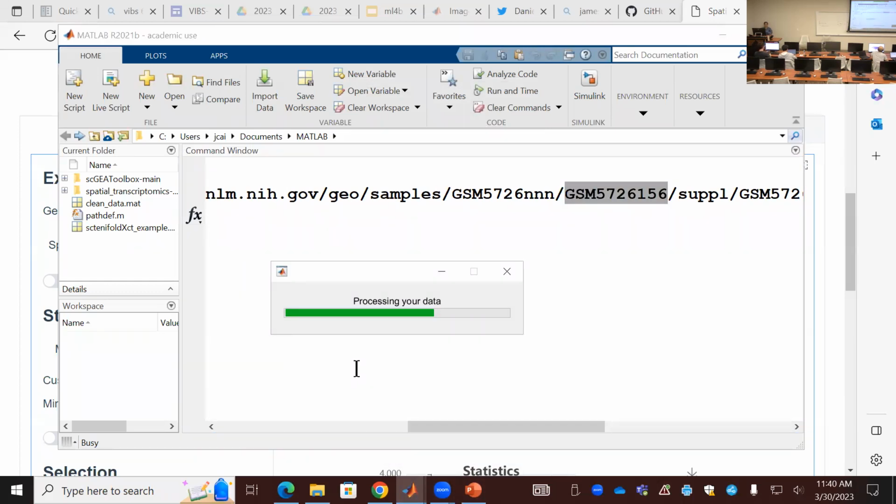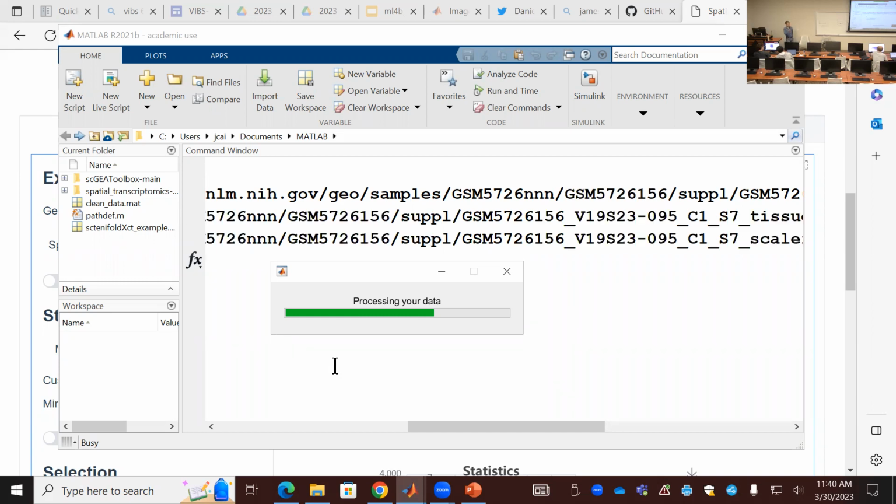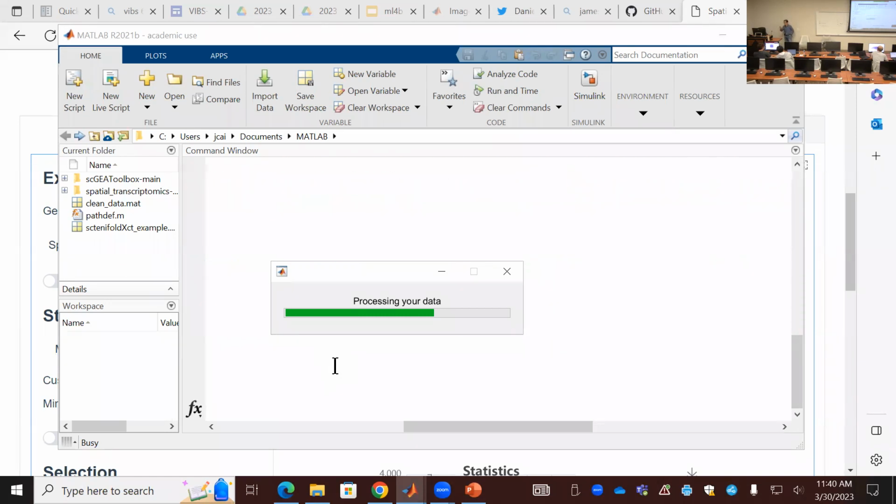If you want to follow it, follow it. If you don't have time, just watch the structure, the process. So you can get those numbers from other people's publication, because once they upload the matrix and also the image of the slides, it should be in the geodatabase, and you should be able to download and automatically process.